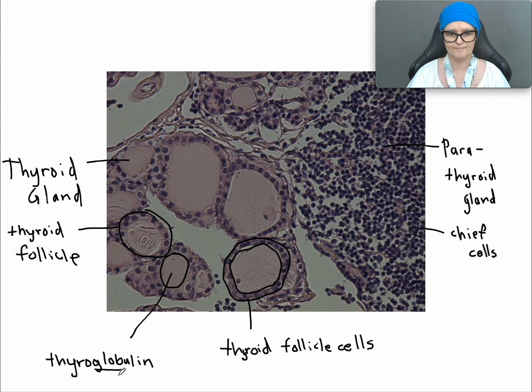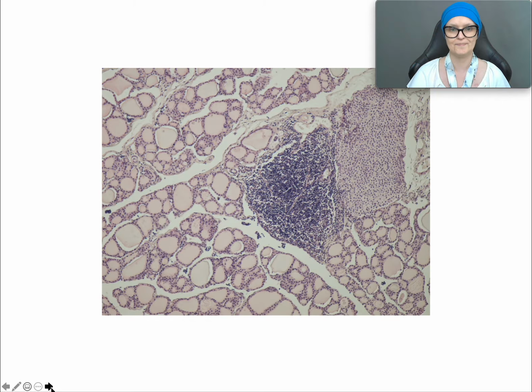So, next slide. Same thing, but zoomed out a little. So name this gland, thyroid gland. Name the entire sphere, thyroid follicle.